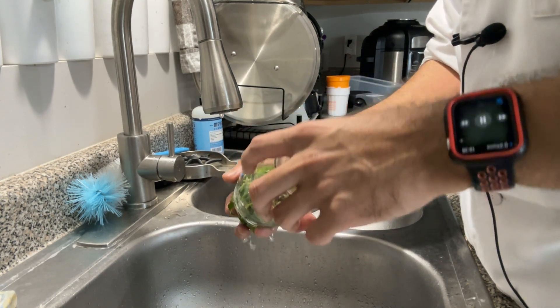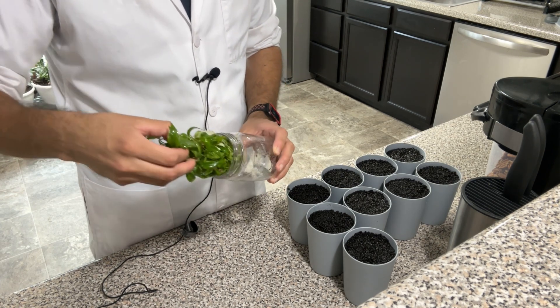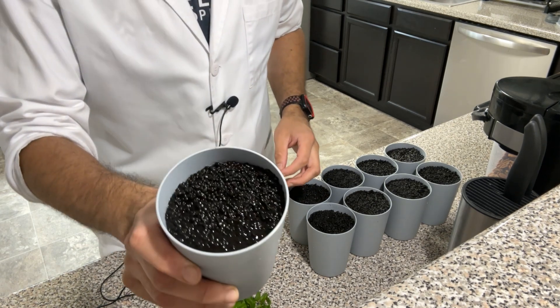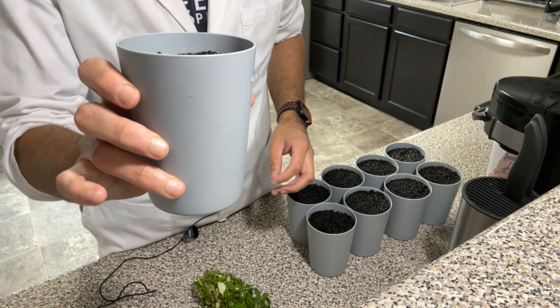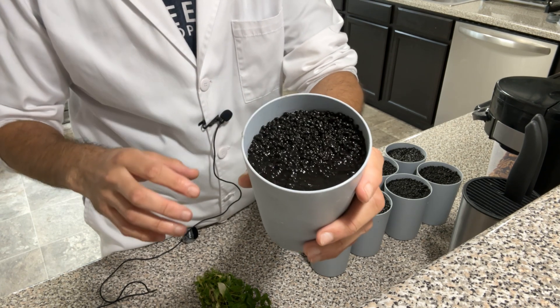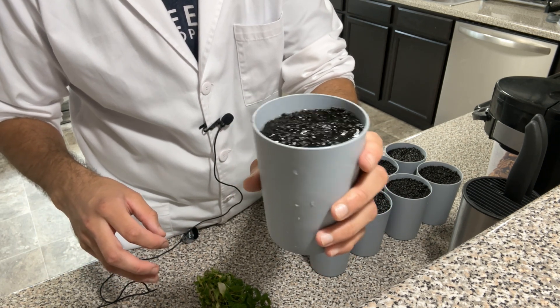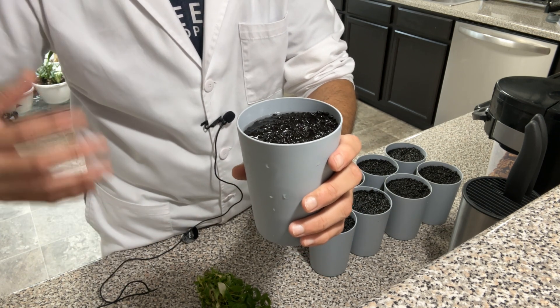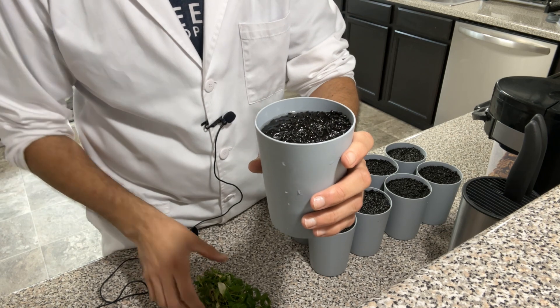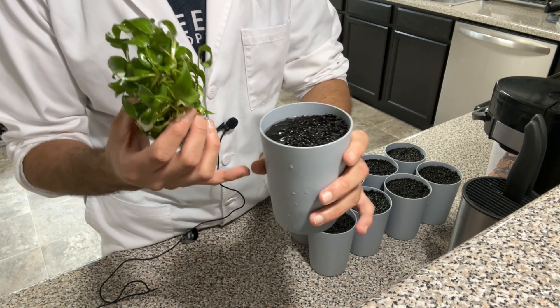Now I have my plants rinsed and clean. For media, I'm using fluval stratum in cups that do not have a hole in them. I added water — probably a little too much, so I'll take some out. The fluval stratum is designed for aquariums, so waterlogging isn't a huge issue, but you have to be careful because these are not aquatic plants and they can still rot. Make sure to keep an eye on how much water you're using.